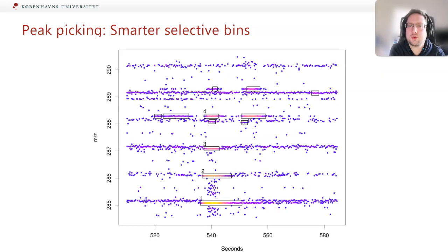Here we have zoomed out to a larger section of the data, and we can see that it has found certain sections that look like they could contain a peak. Also note that most real data always falls in bands with approximately 1 unit mass between them. That is not by chance, but because the mass of all atoms are close to a whole number, and therefore the mass of a molecule will also be close to a whole number.